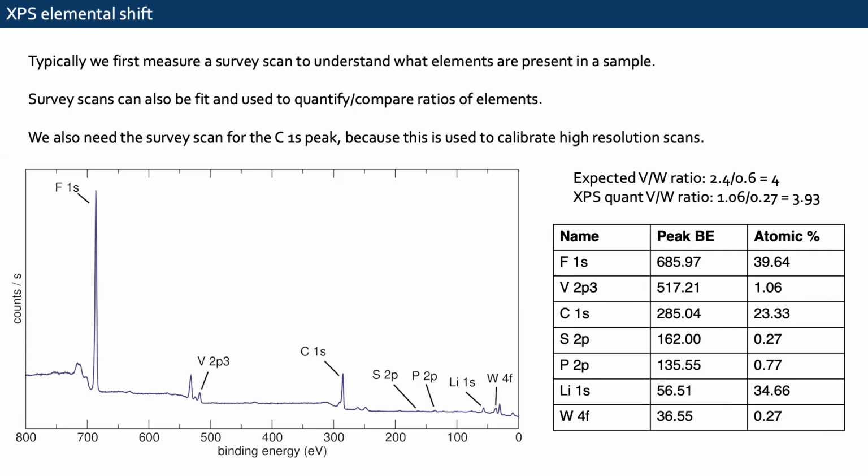And that's also a common way that people quantify elements in XRF too. If you're looking at an oxide, usually you'll also compare the transition metal ratio instead of also including oxygen. Okay. So is the oxygen peak there just not taken into account?